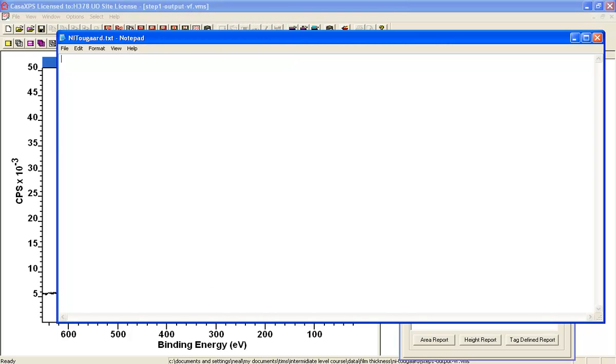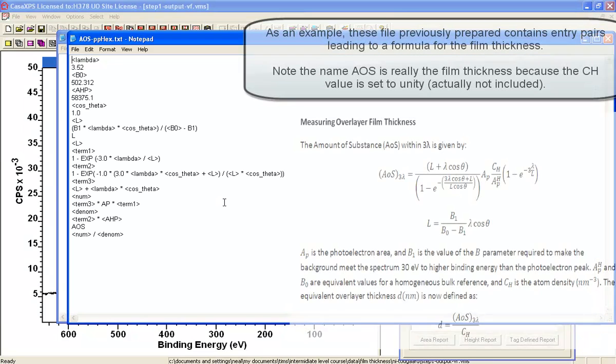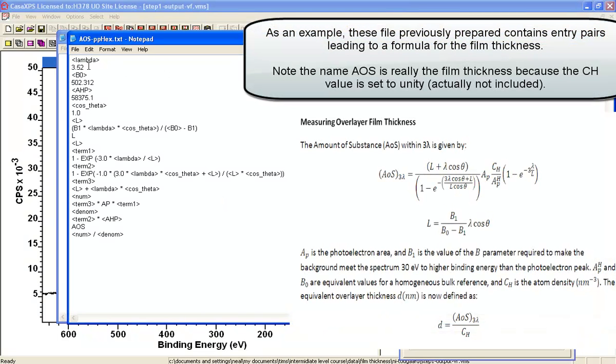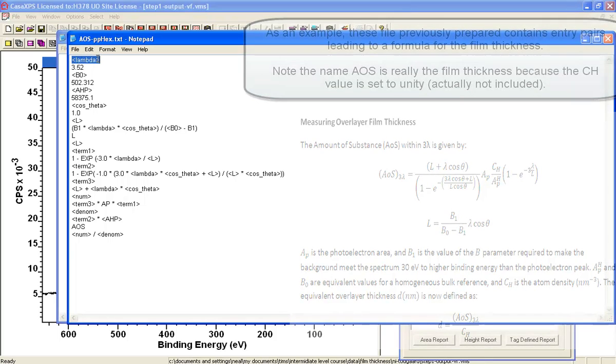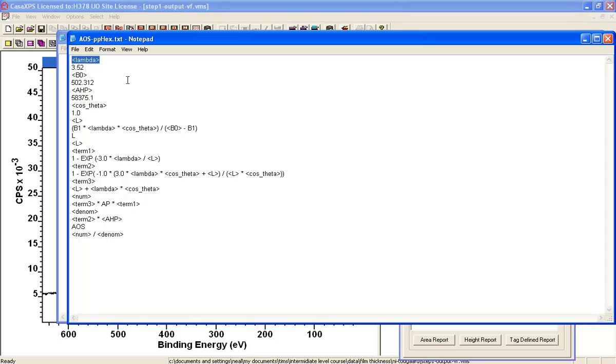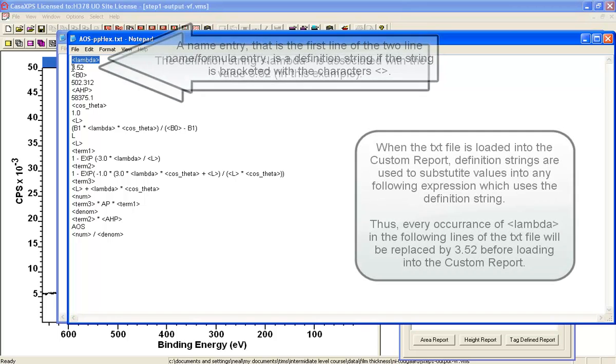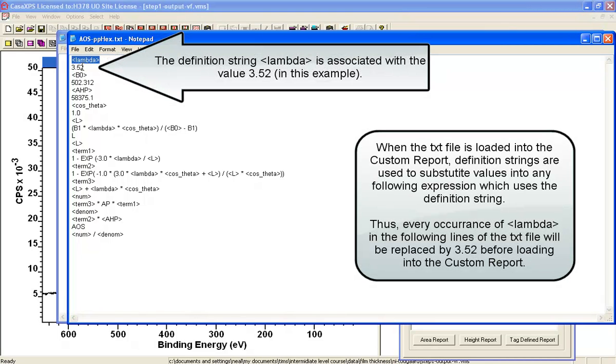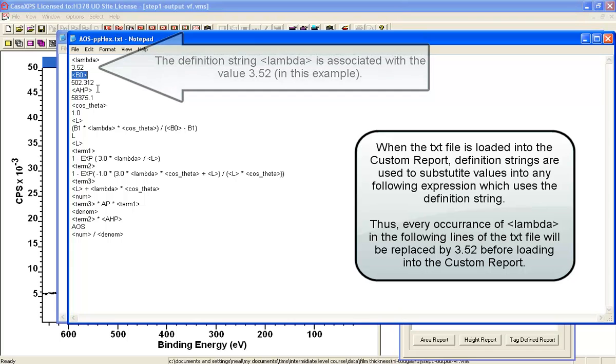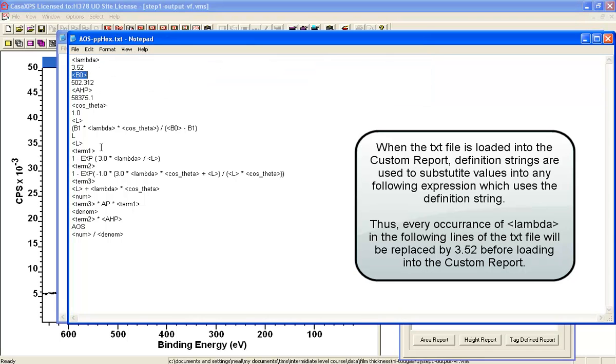Now just to give you a preview of what we're going to do, this is a file that has been previously set up and it contains entries such as this one which is a definition entry which tells me what lambda is equal to, and it's going to be equal to 3.52 in this case. There's a B0 parameter and these are all set up so that ultimately when this file is loaded, each time you see one of these definitions it will be substituted with the value that's been associated with the definition.